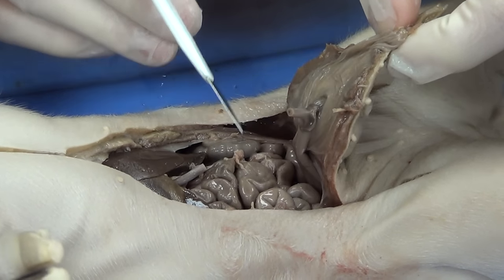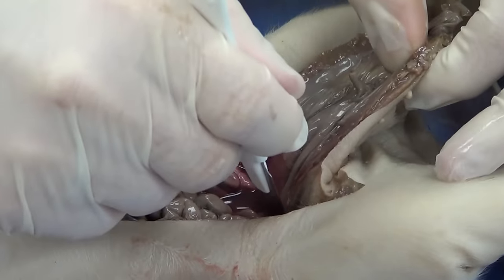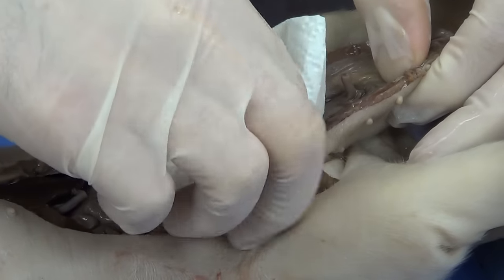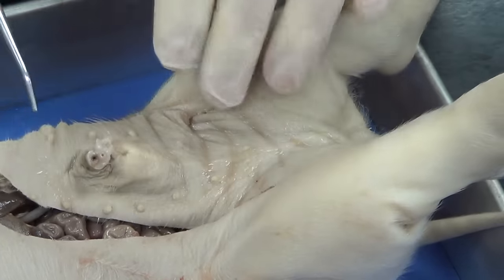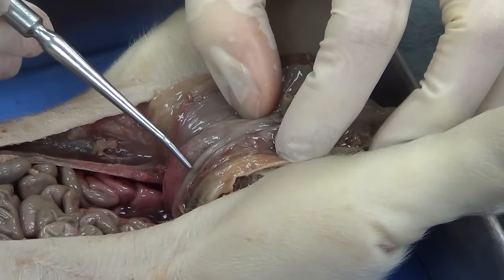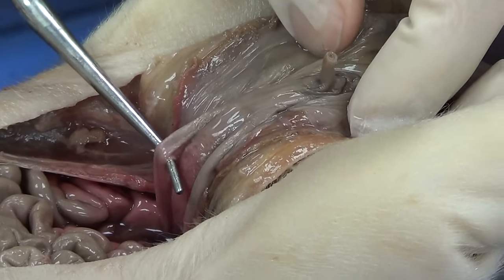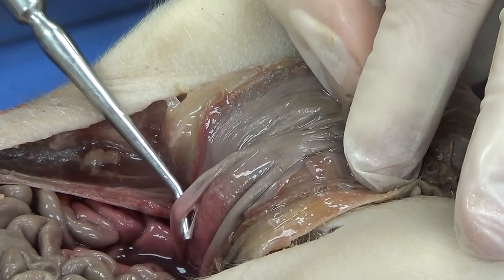I'm going to cut the umbilical vein right in the middle, so I can see where it comes off the umbilical cord and where it comes off the liver. And then I'm going to reflect this back. The reason I cut around the umbilical cord is because of the structures here — there are three structures. The structure I've got the probe underneath is an umbilical artery. You've got two umbilical arteries, and they are diving deep towards the aorta.